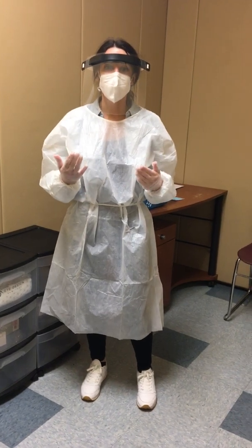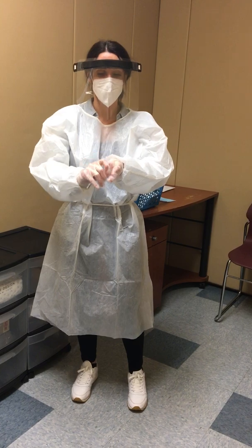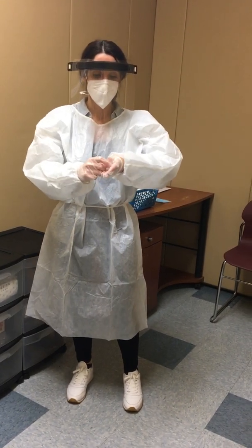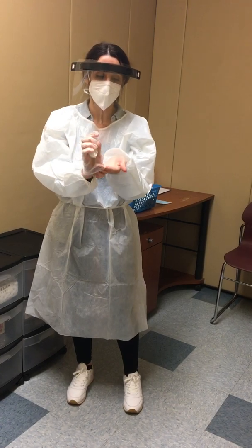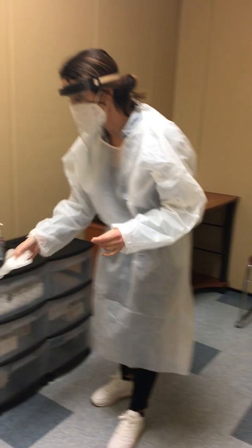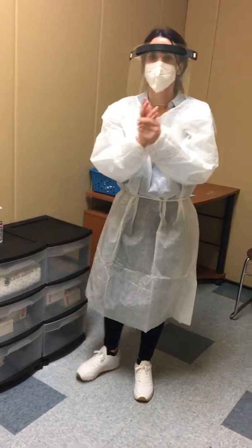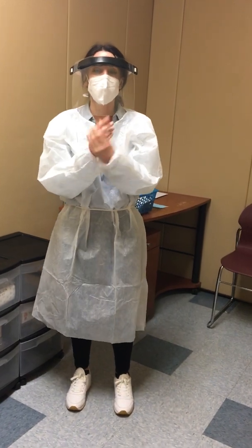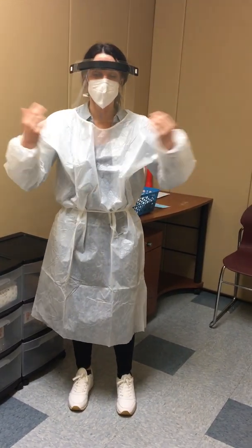So the first thing I would remove would be my gloves, and I would just do that as I normally would by grabbing one of the palms and then sliding two fingers onto the other. I'm not touching the outside, I'm only touching the inside. I would then hand sanitize, and at this point I would then move to removing my gown.